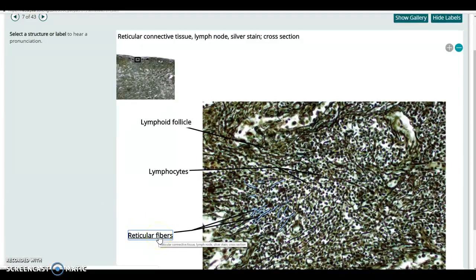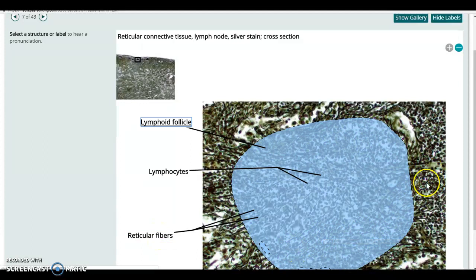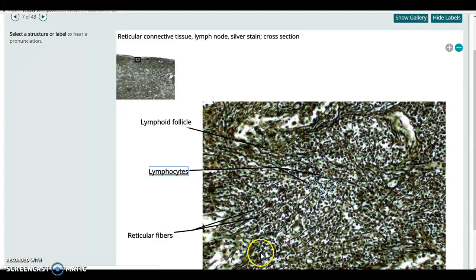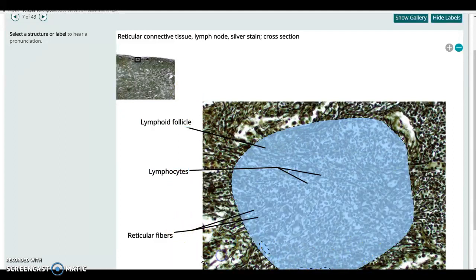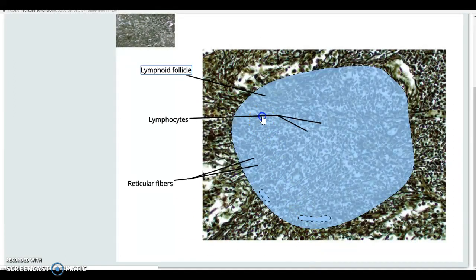Look at all the reticular fibers that are labeled, and if you look through here, you can start to see throughout the entire slide. You can see those reticular fibers just labeled throughout here.